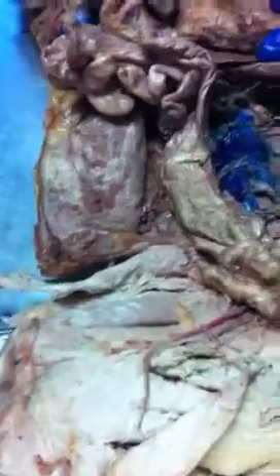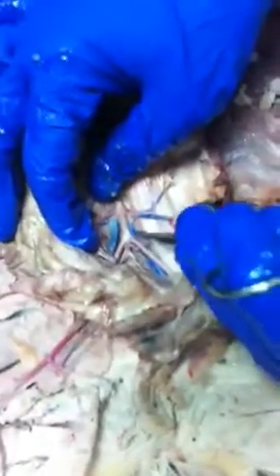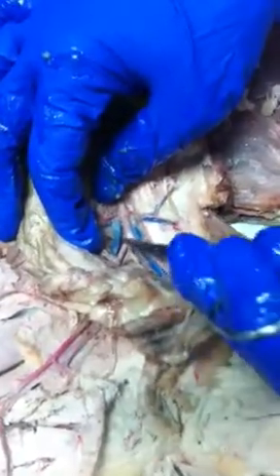Veins do not look very good for me, and you're going to need to make certain you look at other specimens. Because I can't see renals, I can't see gonadals. But I can show you iliolumbars. See those right there? Iliolumbars, and the posterior vena cava is formed from the union of these two huge veins, which are common iliac veins. Okay? Up here.